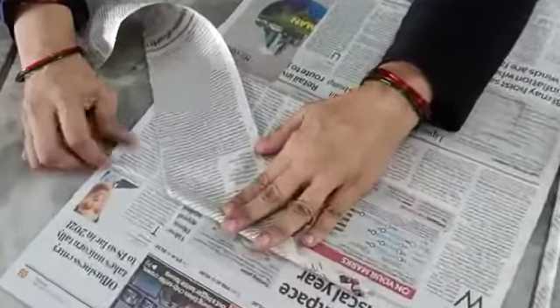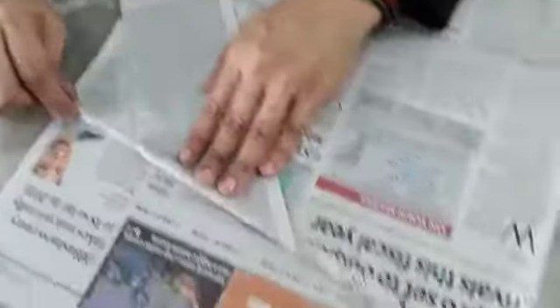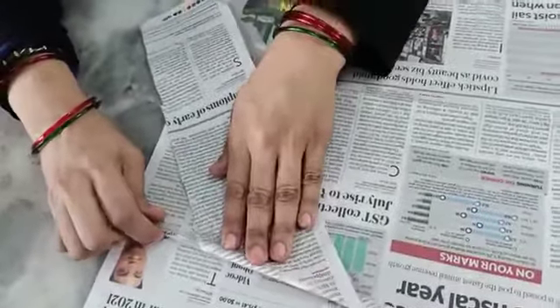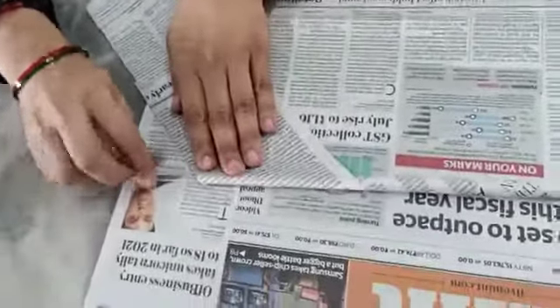Should be very tight, or else it will open up. Make sure that you will be taking the folds at a distance. Should not take the folds very close together.